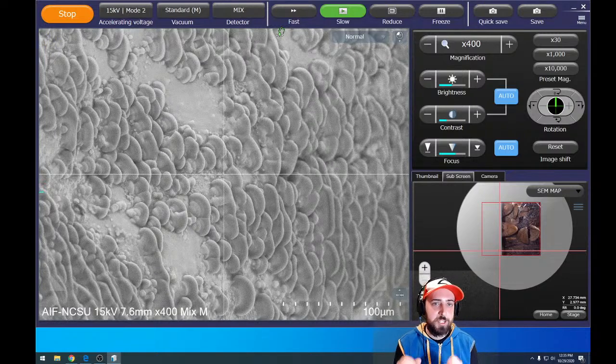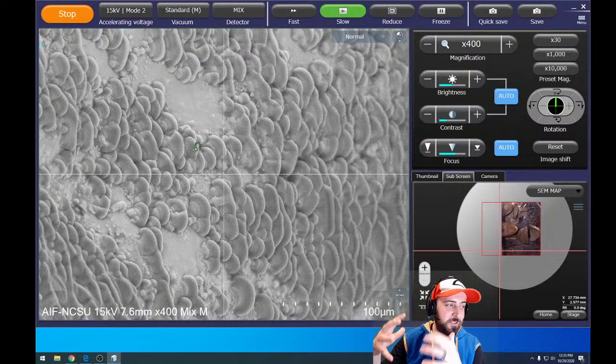And the way we do that is we coat just a little bit of metal on it, usually gold. So all of these are golden chocolate chips or golden marshmallows. It's not a lot of gold, and that helps us image the sample. Now, in that process, we're creating a plasma which is really hot.